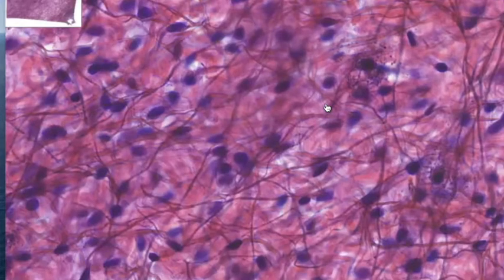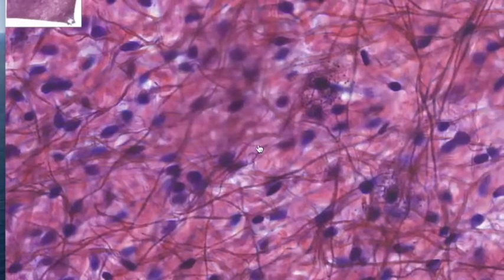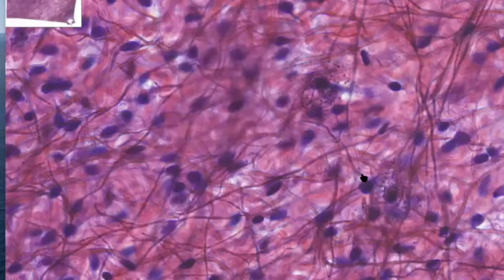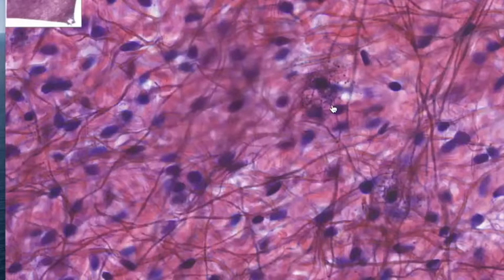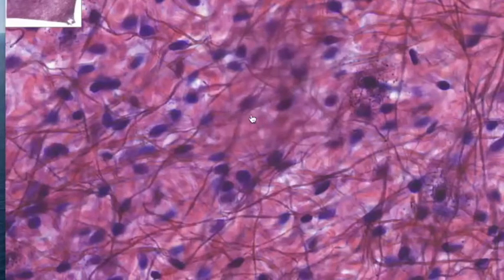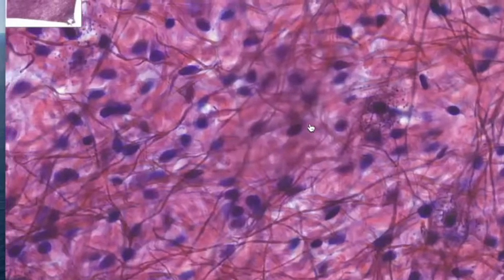In general, if I ask you what this cell is and you can recognize connective tissue proper, the answer is fibroblast. There are other cells — like mast cells that release histamine in response to inflammation — but as far as this class is concerned, the cells are mostly going to be fibroblasts.